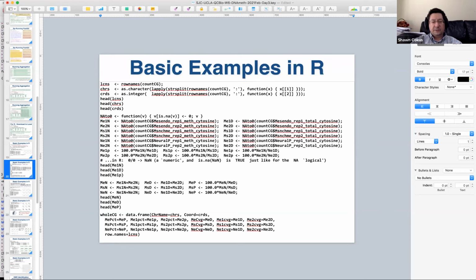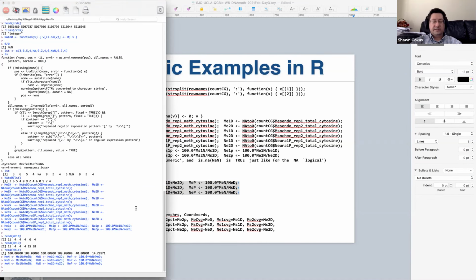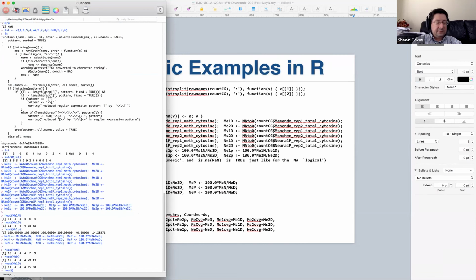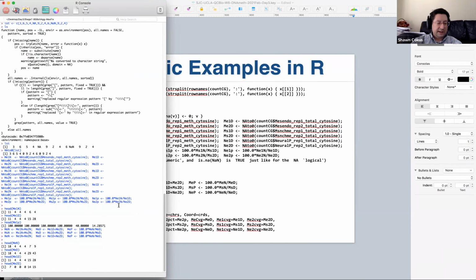Okay, so these are at the site level, so we're going to do the pool numerator, pool denominator, then divide method for this. Okay, so there we go. And these look just the same as the other. The coverage will be a little higher now because we've done some pooling. If we wanted to verify, I guess we need the ME1D and the ME2D. That's the two denominators that we added, 28 plus 15. That should be the 43. Yeah. Okay. So the coverage has been pooled now.